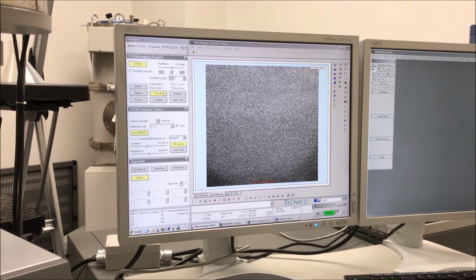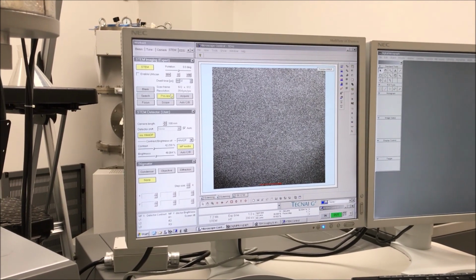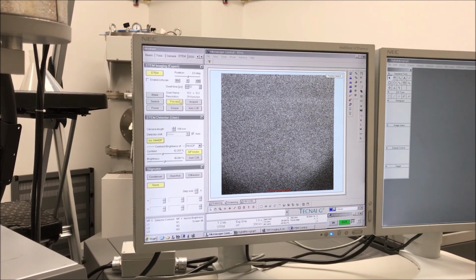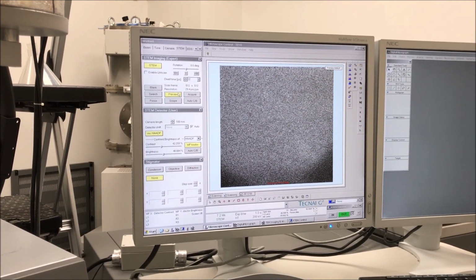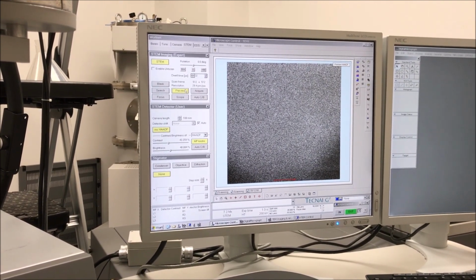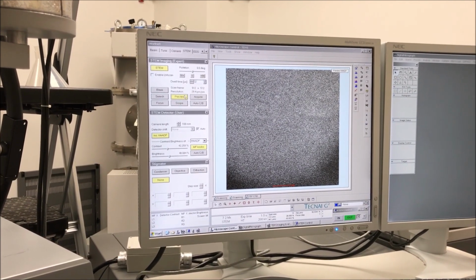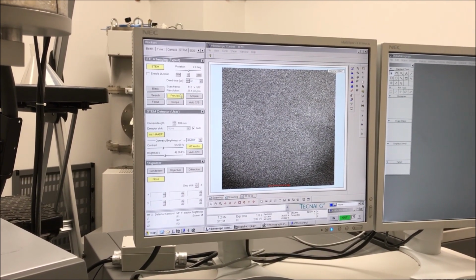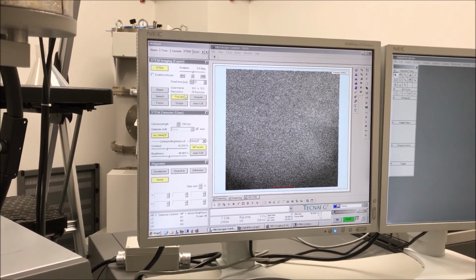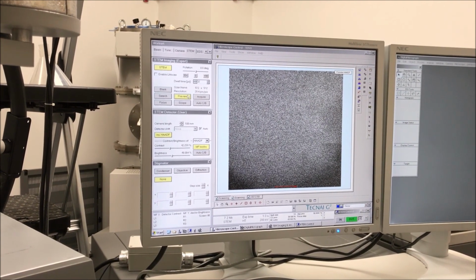I have a new video for you today, and the topic of today's video is going to be contamination when you are performing TEM. Specifically, what is contamination, why we get it, why it's bad, and how to manage it so it doesn't impact your results. So what I want to start by showing you right now is a HAADF-STEM image of a silicon sample along a 110 zone axis.